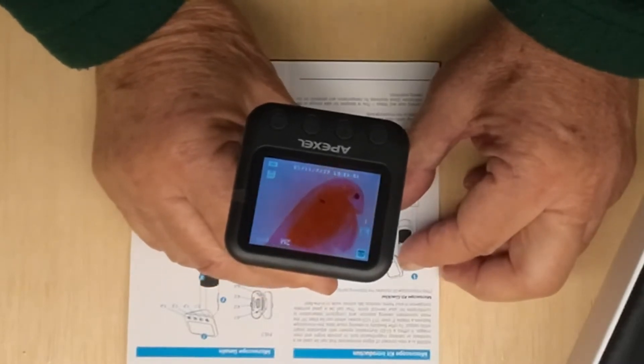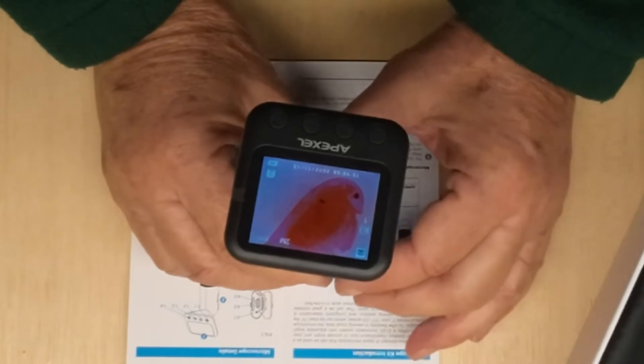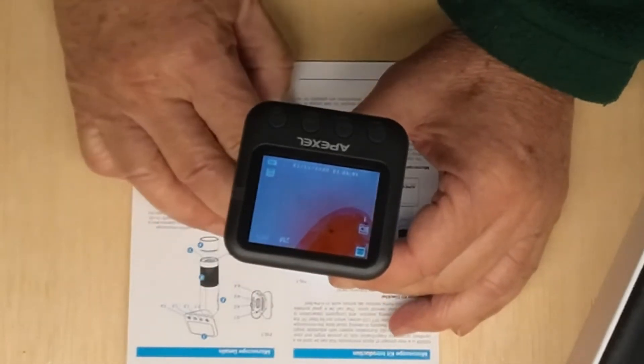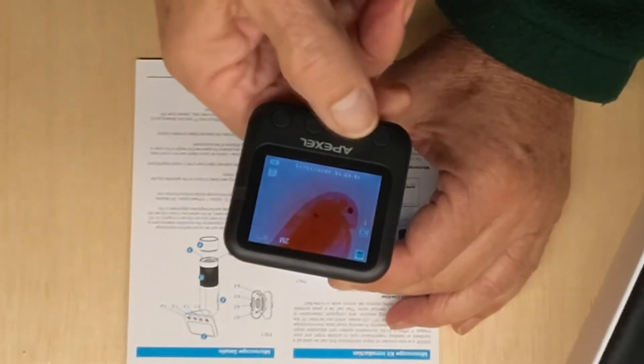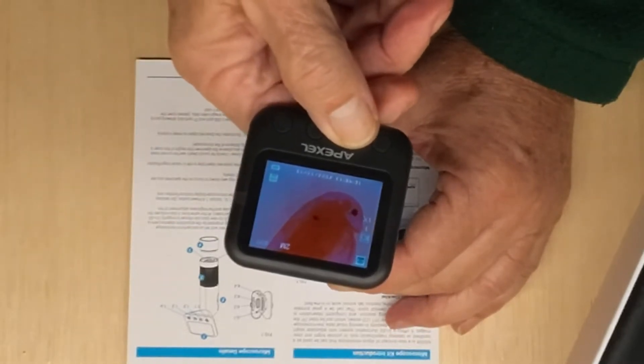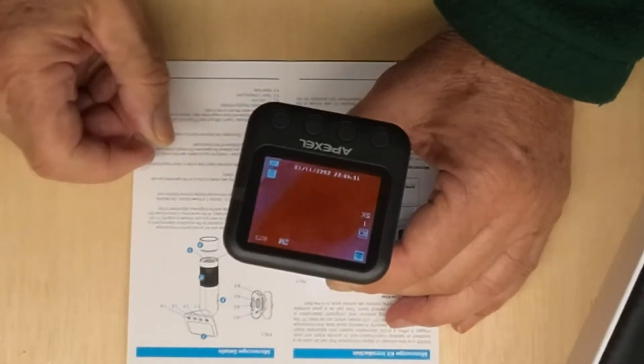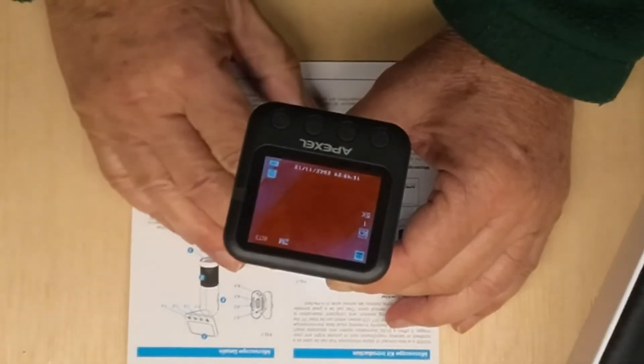There it is, and not only can you get a good look at it, but you can zoom right in on it using this button here for a closer look. So this is pretty handy for anything that you can put it right down onto.